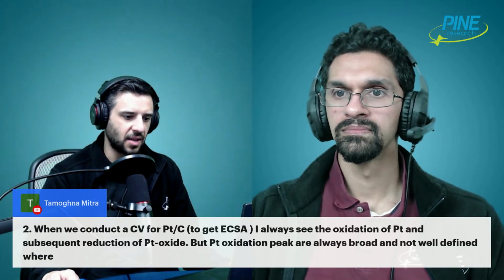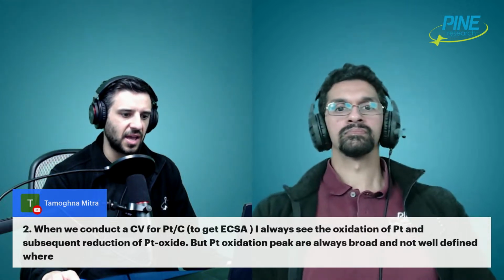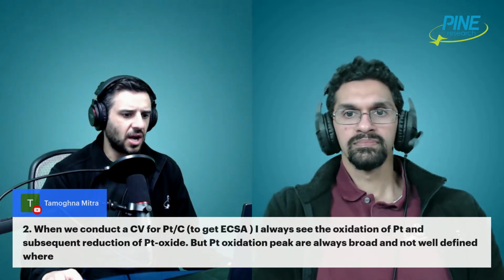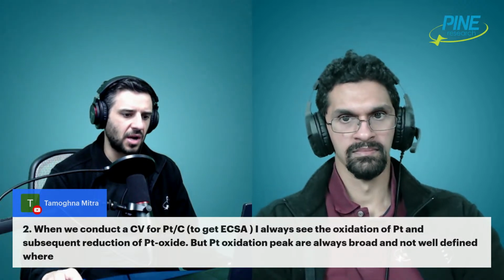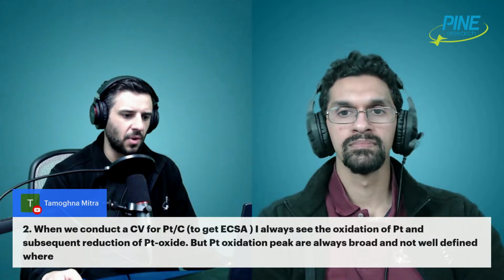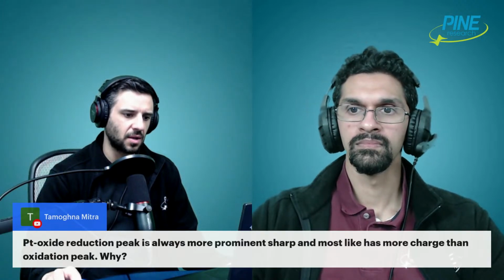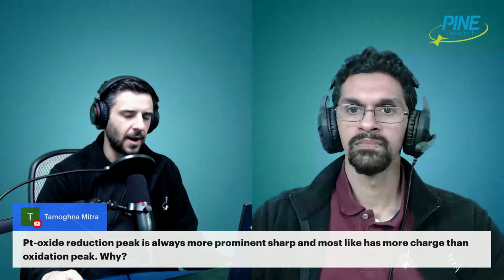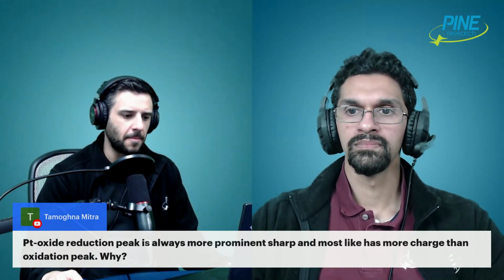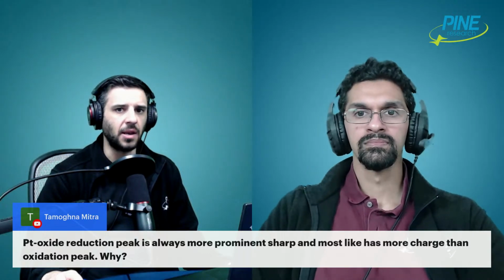And then the second question here is that when we conduct a CV for platinum on carbon to get ECSA, I always see the oxidation of platinum and subsequent reduction of platinum oxide, but platinum oxidation peaks are broad and not well defined, whereas the platinum oxide reduction peak is always more prominent, sharp, and has more charge than the oxidation peak.